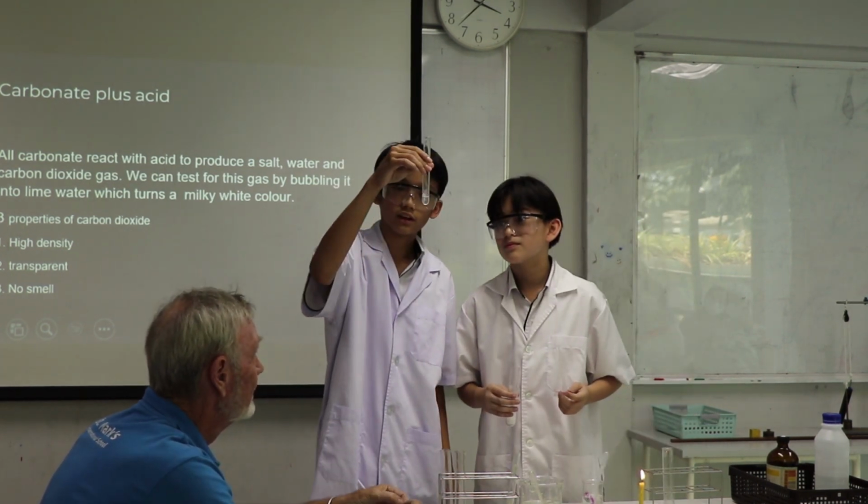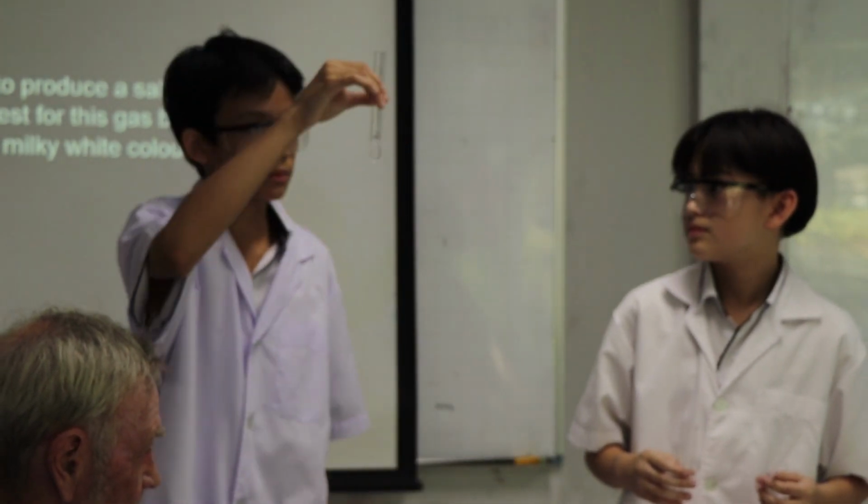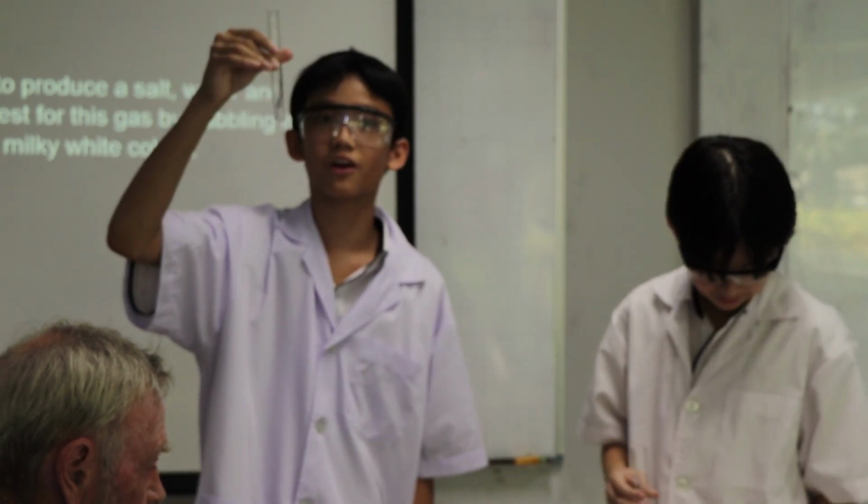Now as you can see, the water isn't as clear anymore as it used to be. It's turned a milky white color, which proves this to be a positive test for carbon dioxide.